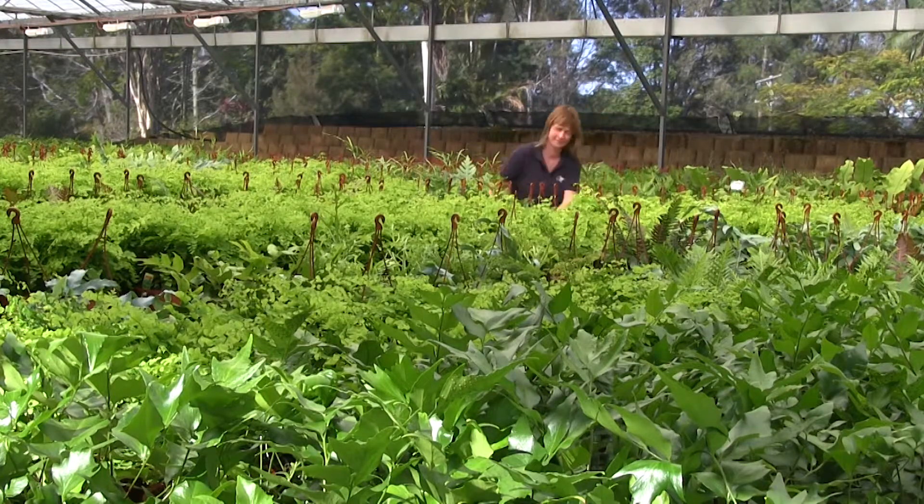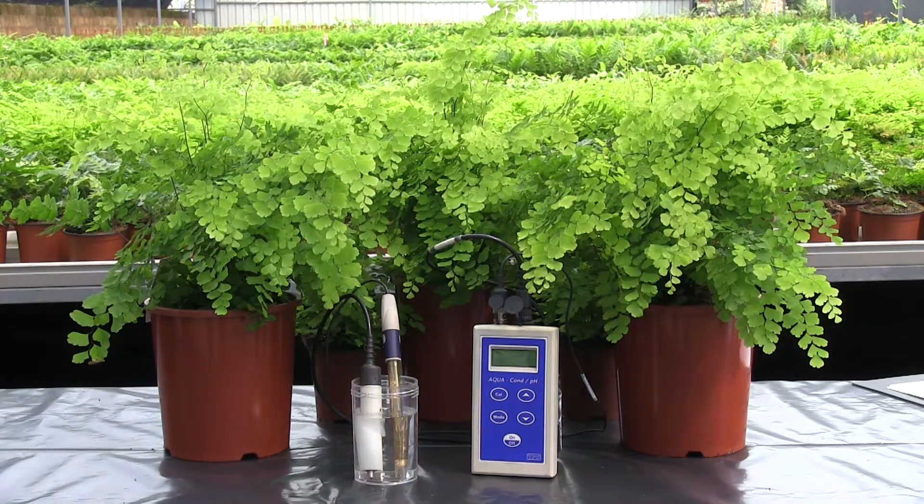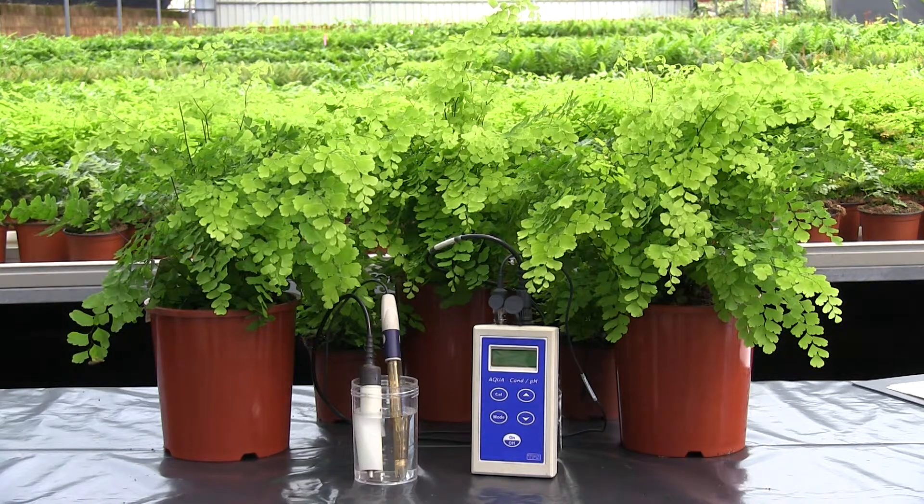Knowing the pH and electrical conductivity of your growing media can help you grow better and more consistent crops. Testing procedures are not difficult and can be done at minimal cost. The following video shows a process for carrying out a practical on-site pH and electrical conductivity test on growing media.